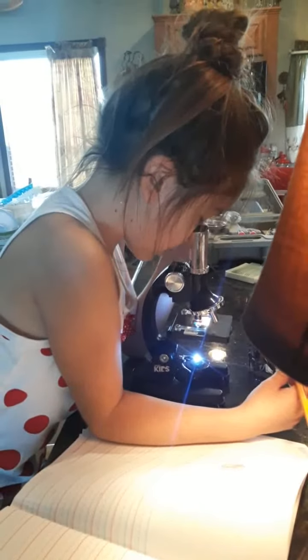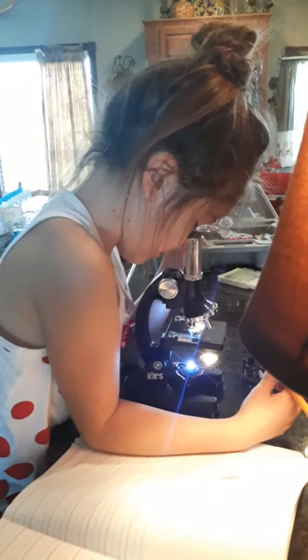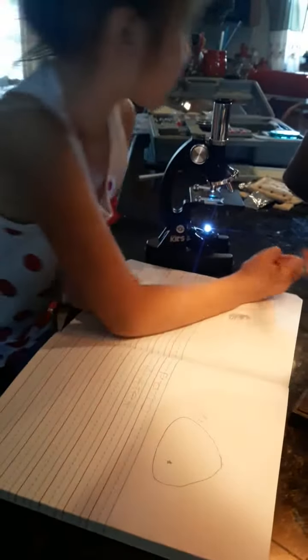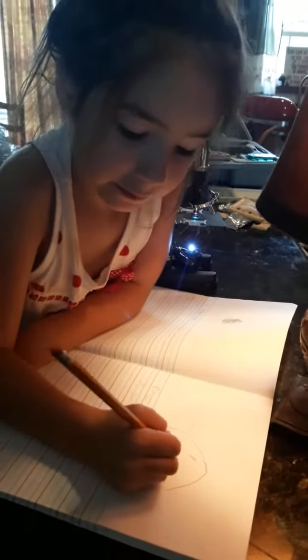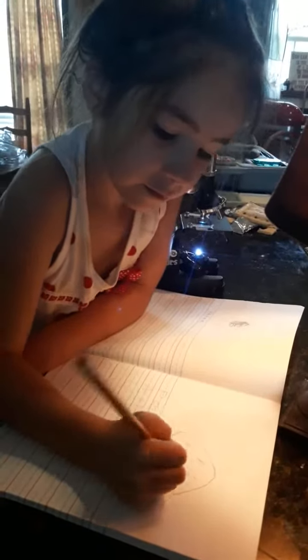Oh, I see a little floating in there. Really little. This is what it looks like and I think the things are removing our germs.